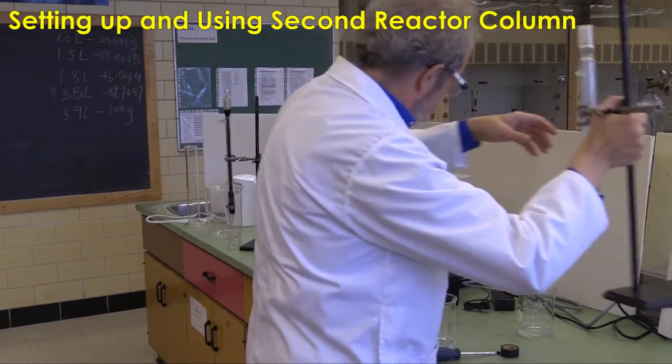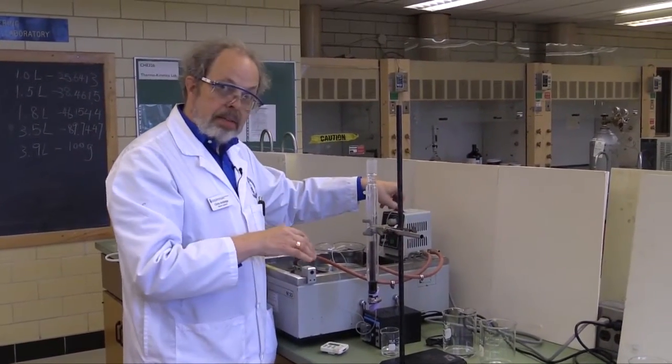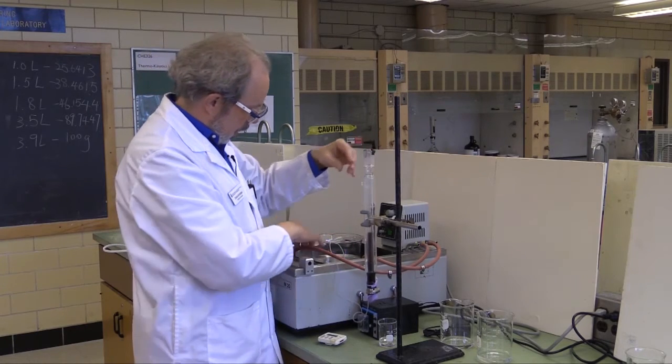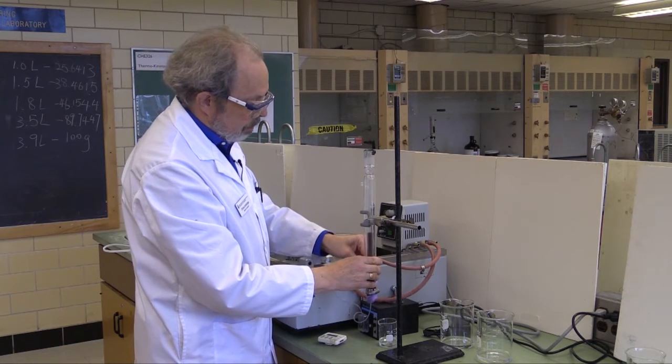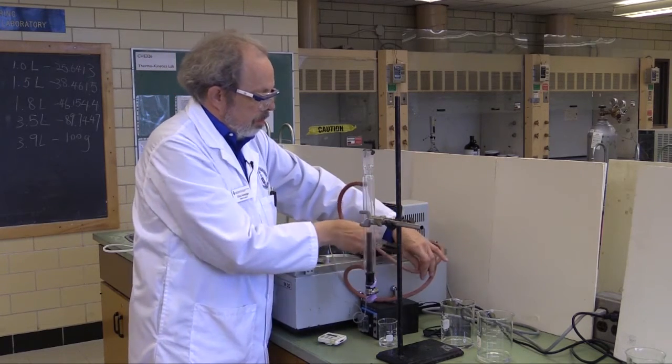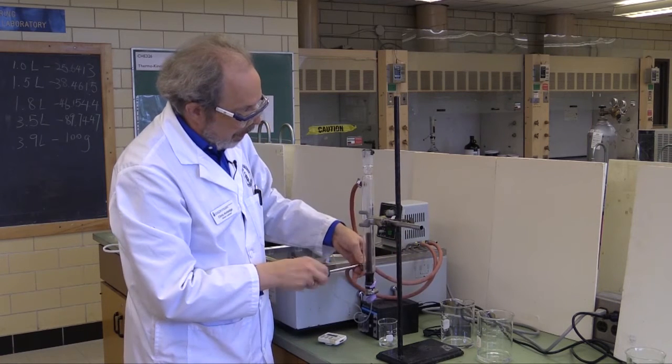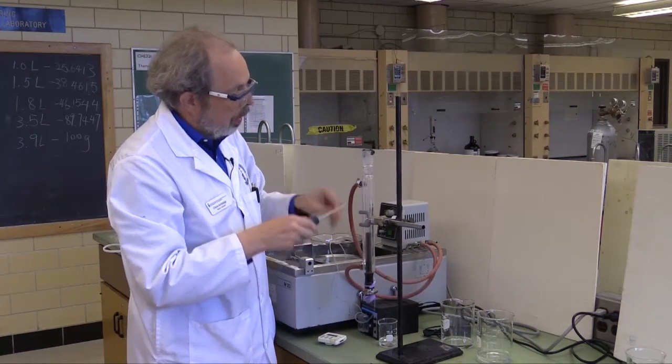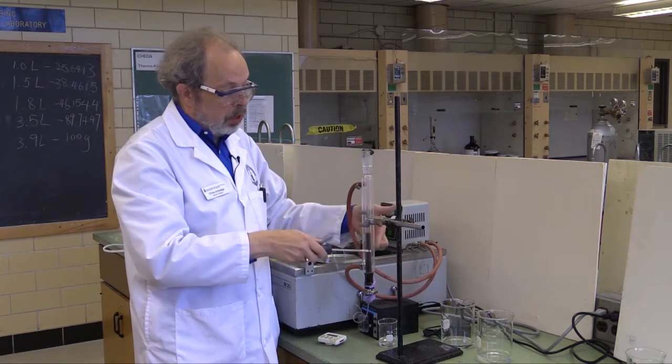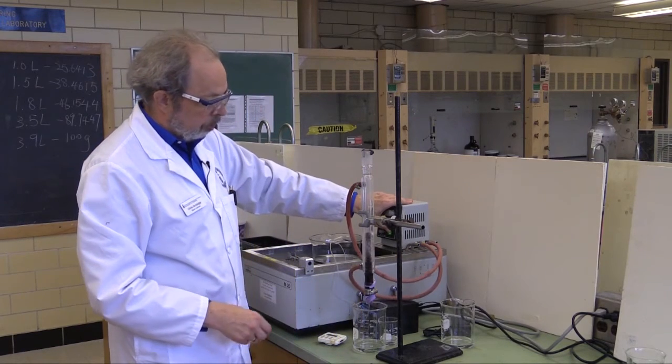We'll now bring the column that you packed over and place it in exactly the same place. And you just set this up in exactly the same way as you had before. Put the inflow into the reactor, and again, hold it in place with electrical tape, and reconnect the heating water tubes. And you'll need to reconnect the hose clamps. And once you have done that, you can turn the water bath back on. And this system can then come to thermal equilibrium. You'll need to leave it for a few minutes because the stuff inside is not at 60 degrees.